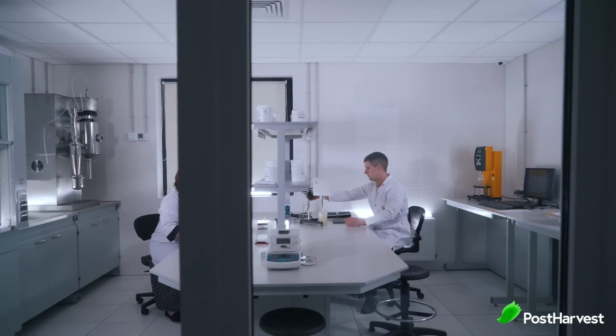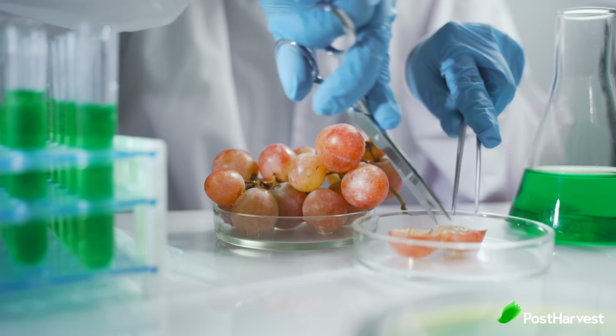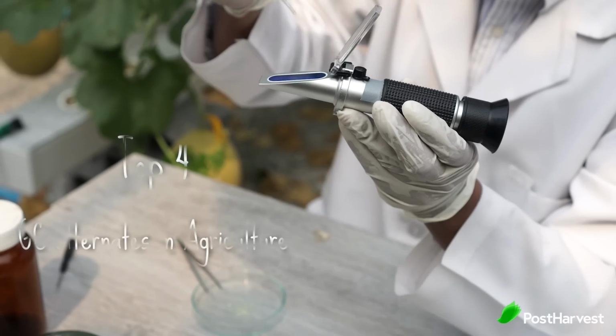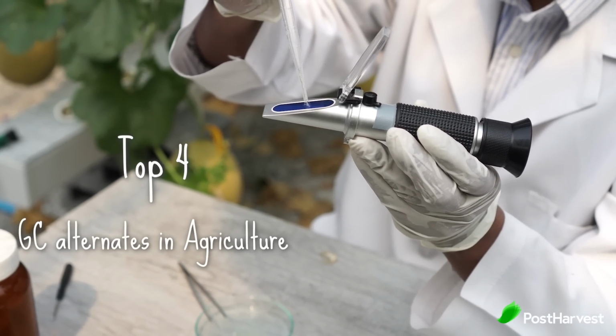Most countries, including America, require companies to test and report their results to ensure high quality goods. But in this video, I want to talk about the top 4 GC alternatives in agriculture.